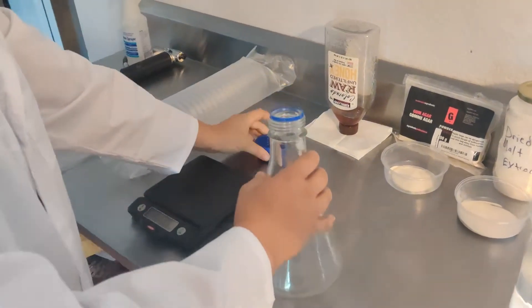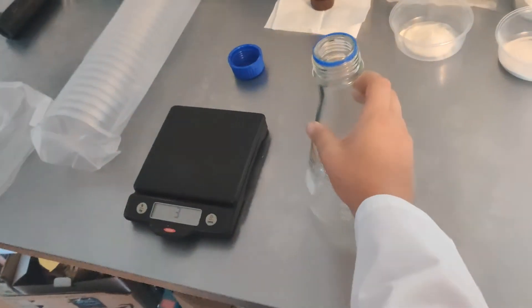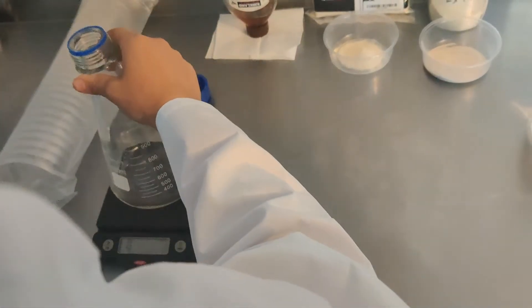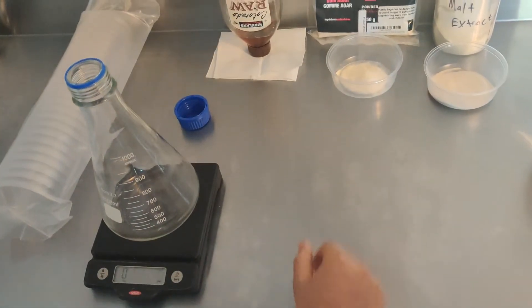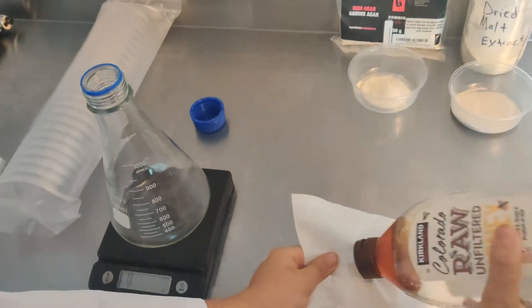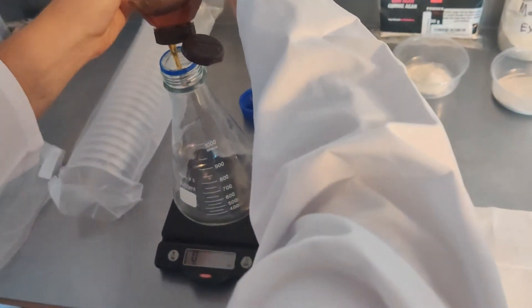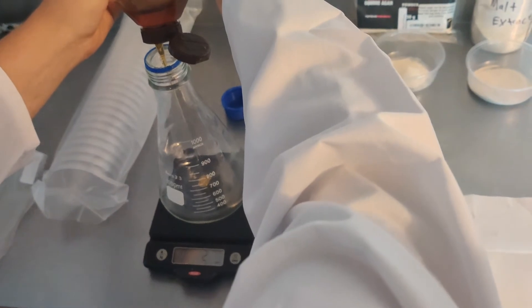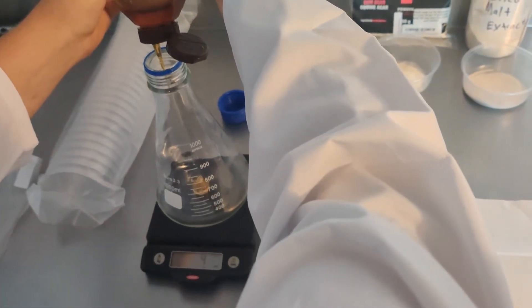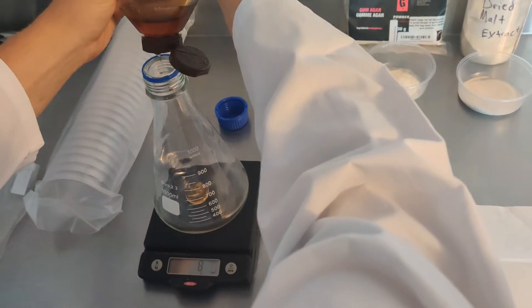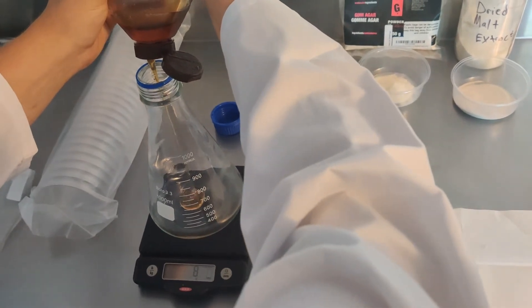First we'll add the honey to the Erlenmeyer flask. Today we're pouring 500 milliliters of agar solution, so we're going to use about 10 to 15 grams of honey.